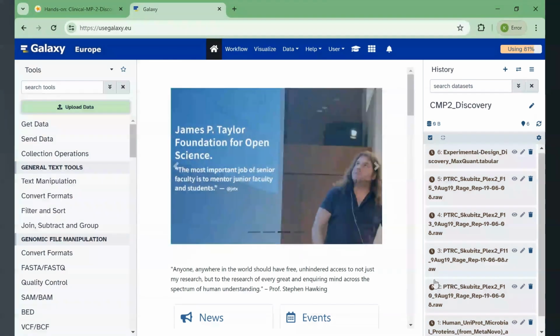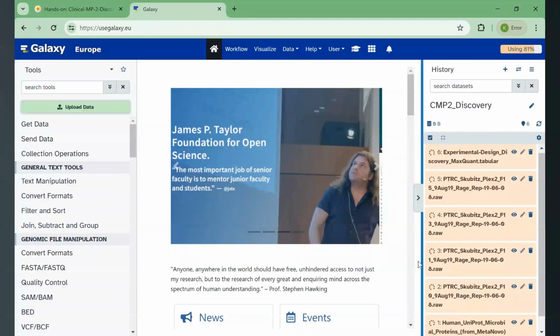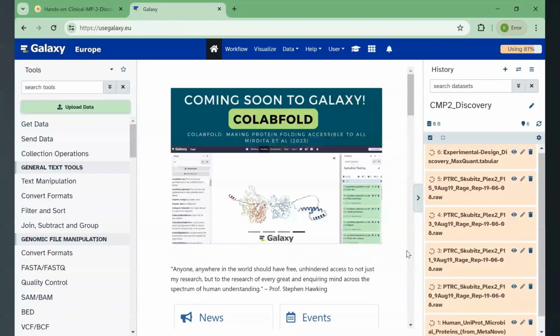And again, we will create a dataset collection of our sample data to keep things organized. We have provided the same 4 example datasets that were analyzed by LC-MS-MS, with the only difference being that they are in RAW files to be compatible with software in this module.